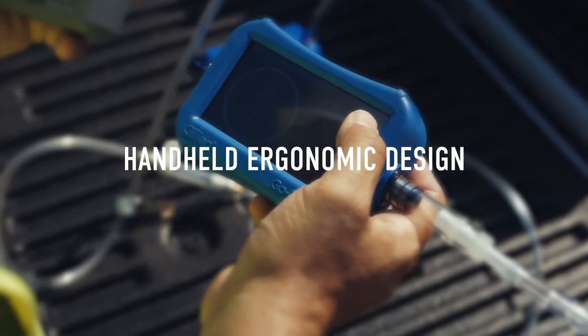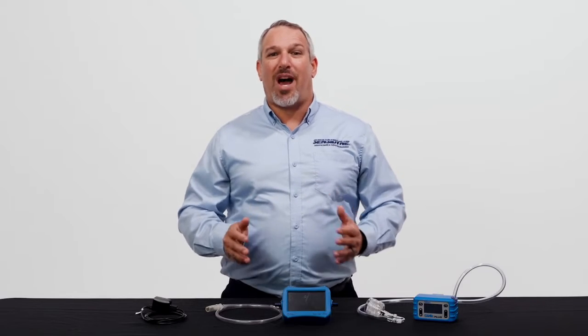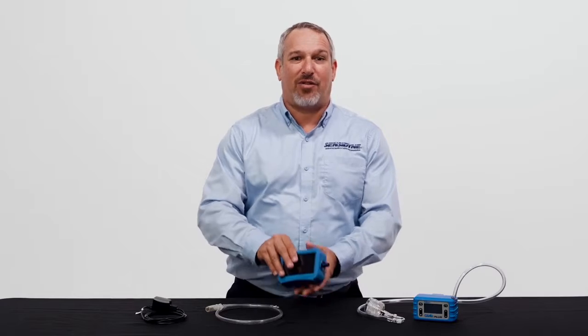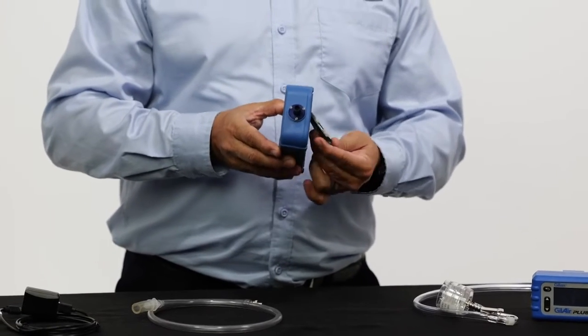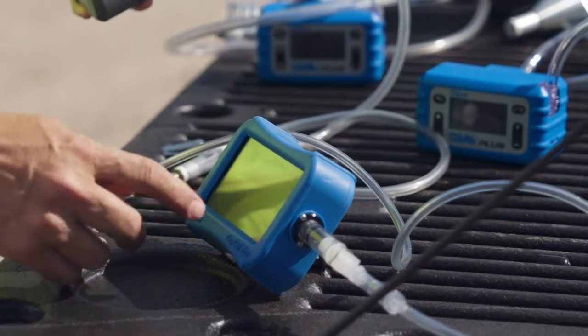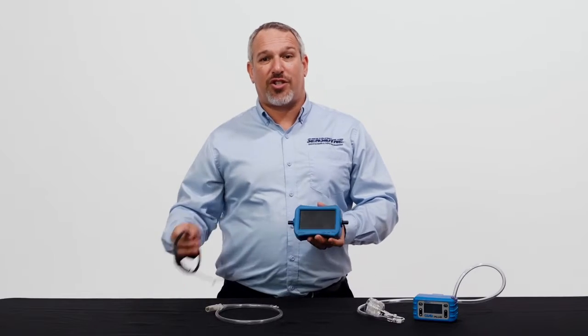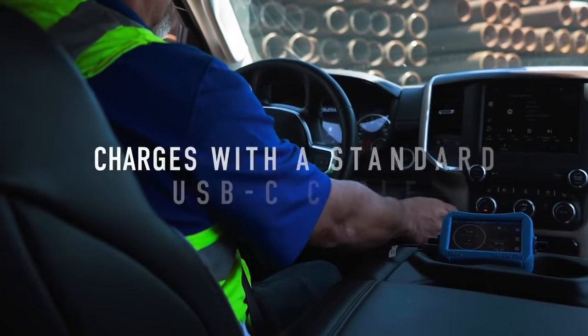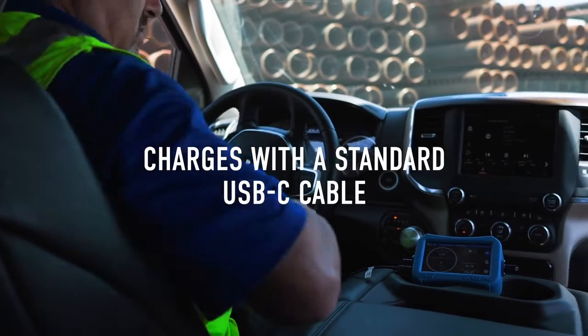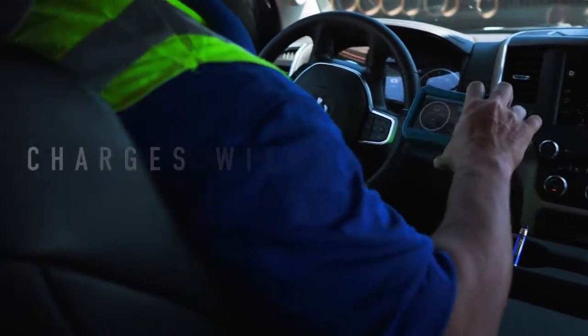The next feature I'd like to discuss is portability. The GoCal Pro is small, durable, and lightweight. It has no moving parts. It was also ergonomically designed to be handheld. It also features a collapsible kickstand that can be used on a countertop or any flat surface available in the field. The meter is charged with a standard USB-C cable, allowing the device to be plugged into a wall or even an outlet in your vehicle.